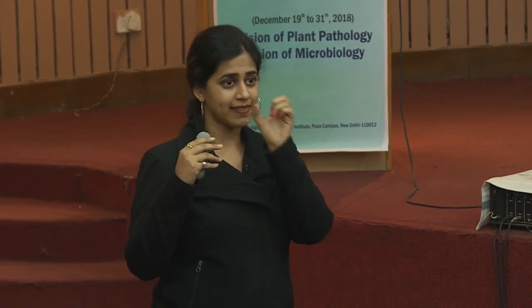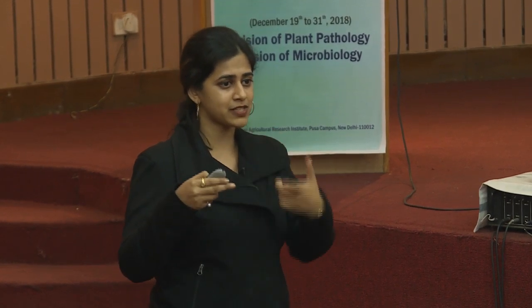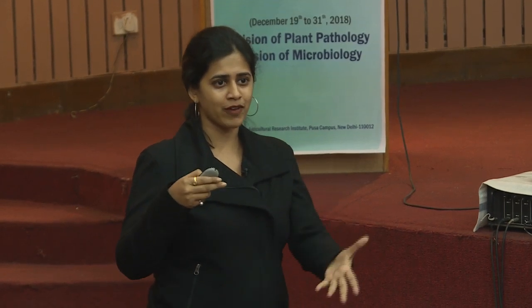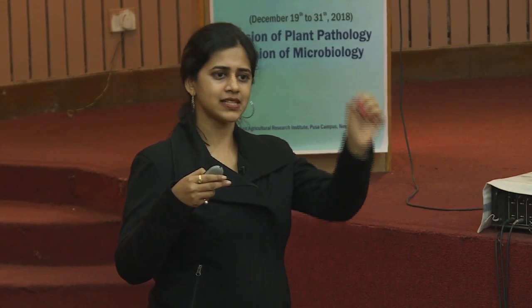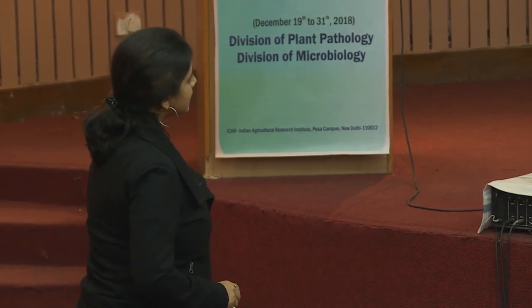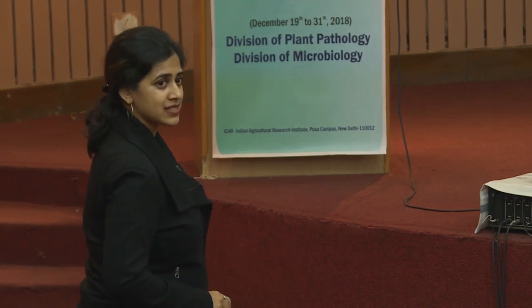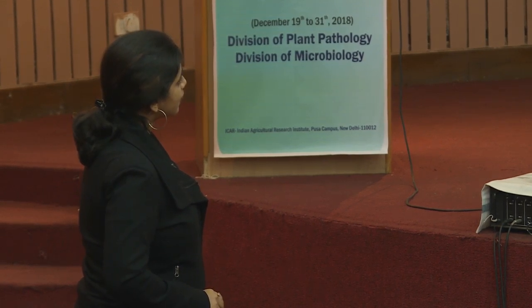Anywhere it gets an overlap of certain bases that has been specified when we are using an overlap based algorithm, we specify I want 100 bases to be overlapped, I want 50 bases to be overlapped, I want 5 bases to be overlapped. Based on my requirement, I will tell that this much base overlap I require. So, this is the way it will find the overlaps between the sequences. If I have raw reads, the raw reads will get an overlap like this.